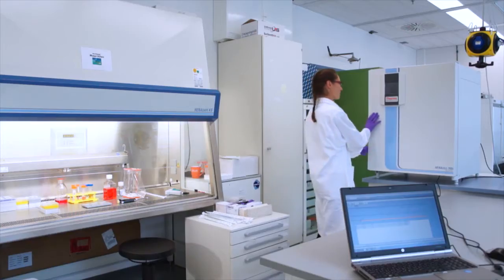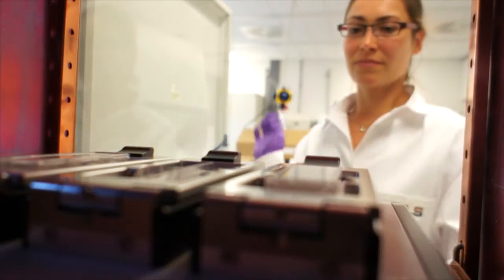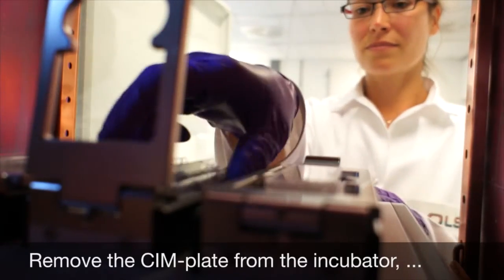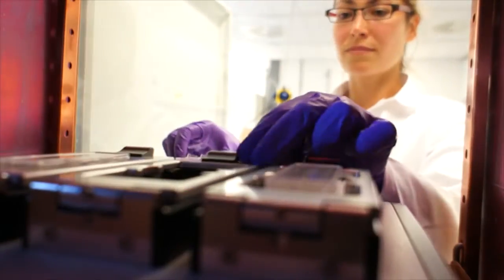Remove the CIM-plate from the incubator and seed a defined number of cells into the top chamber of the E-plate. The optimal seeding density for your experiment depends on the cell type and the experimental design.